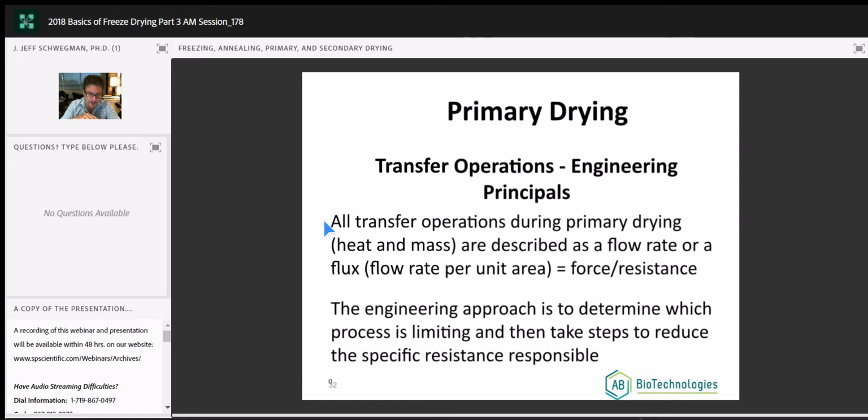When you go to buy a production scale unit, that is a made-to-order unit. And the engineers will tell you, you should do this or you should not do this. Listen to them. There are certain companies that have not, and it's come to bite them. So definitely listen to the engineers when they talk about designing the freeze dryers.